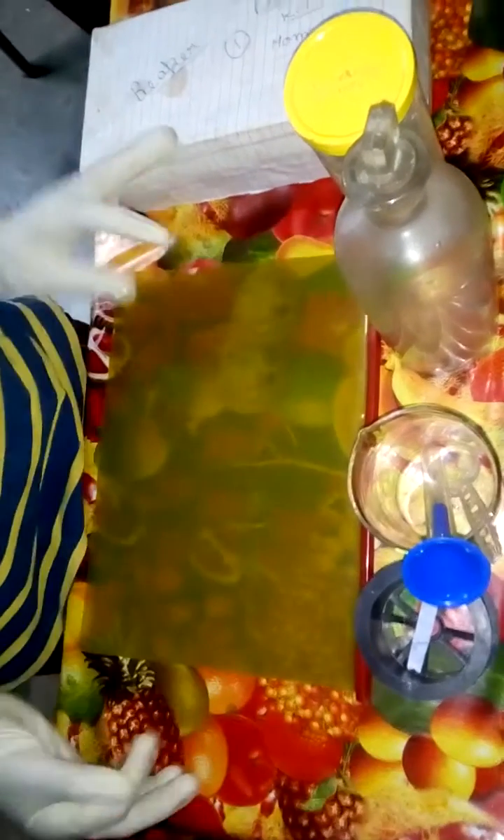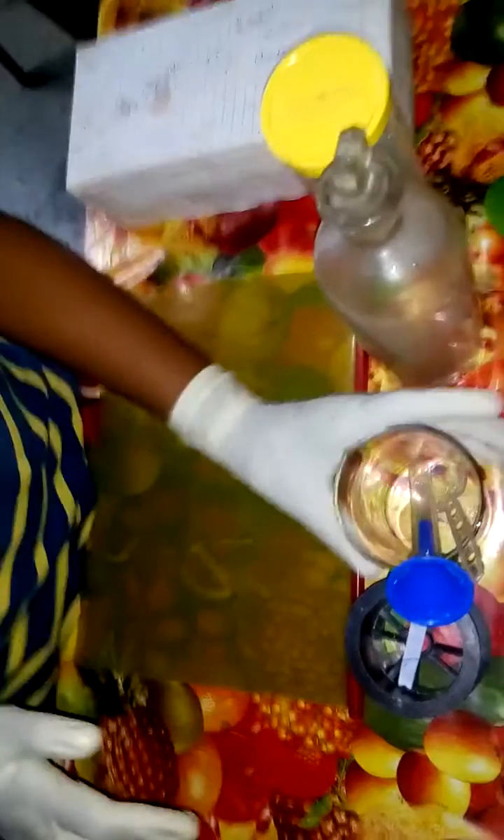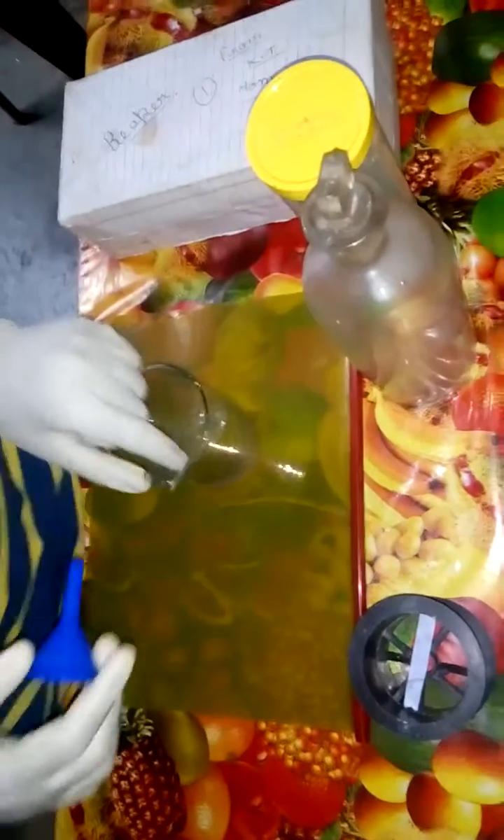Hi guys, in this video I am going to show you how to make sodium sulfate by the laboratory method. For this you will need a beaker, test tube, funnel and spoon, litmus and mini test tube stand. You will also need reagent bottles and sodium bicarbonate.